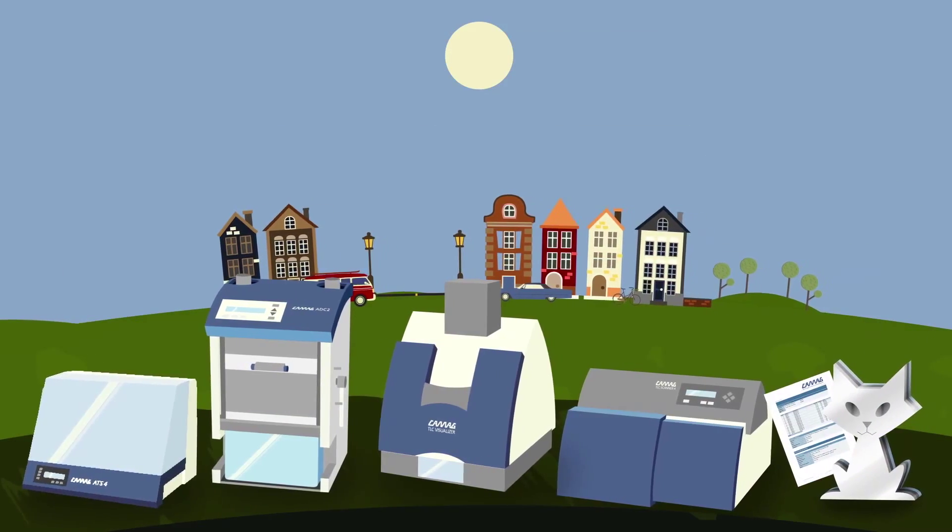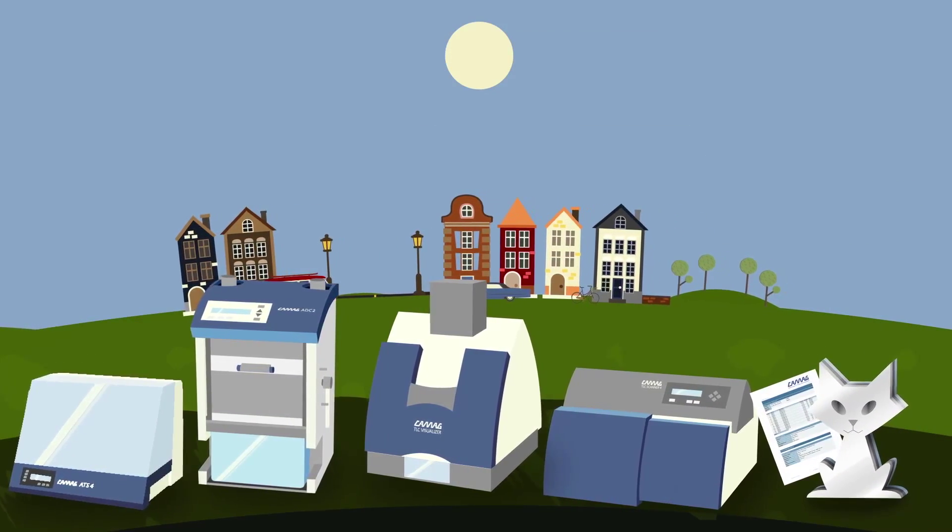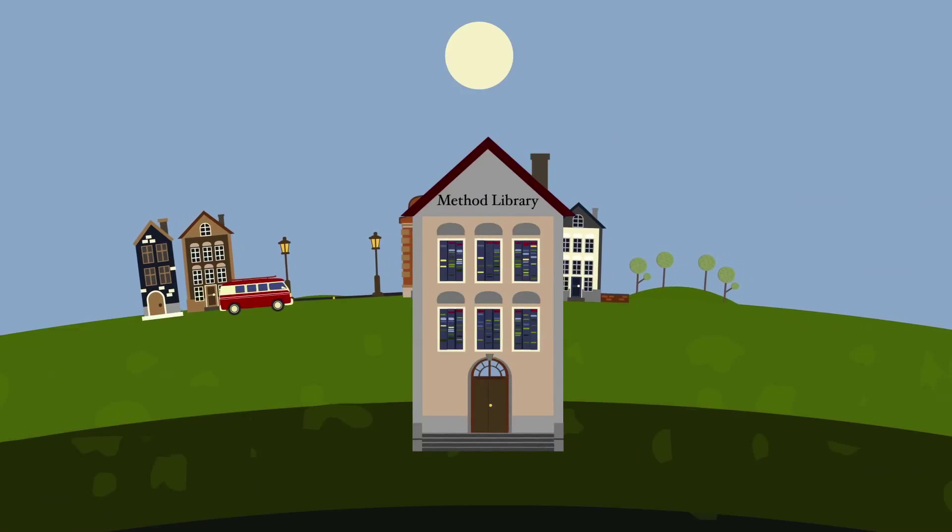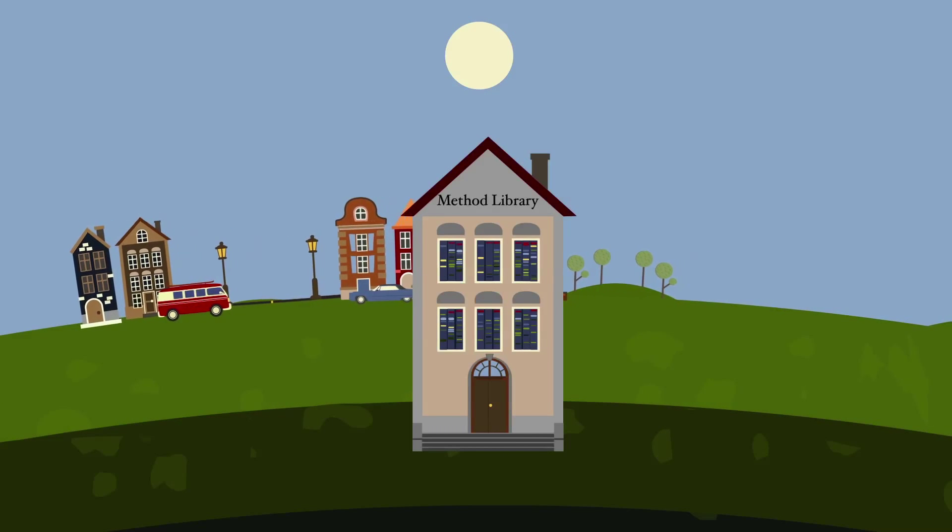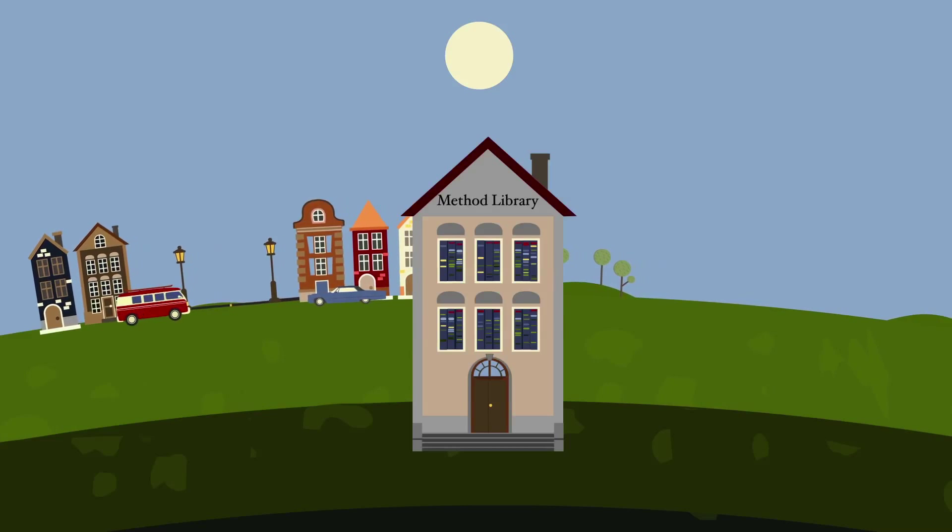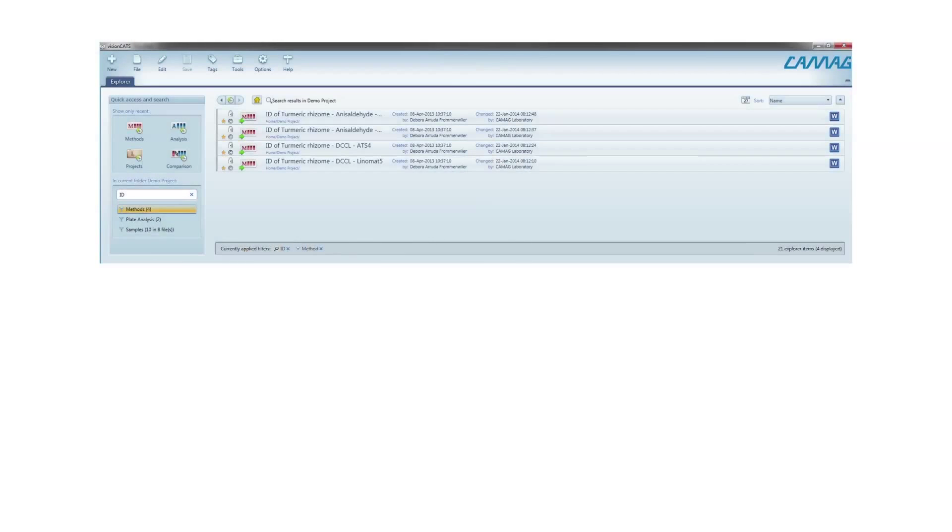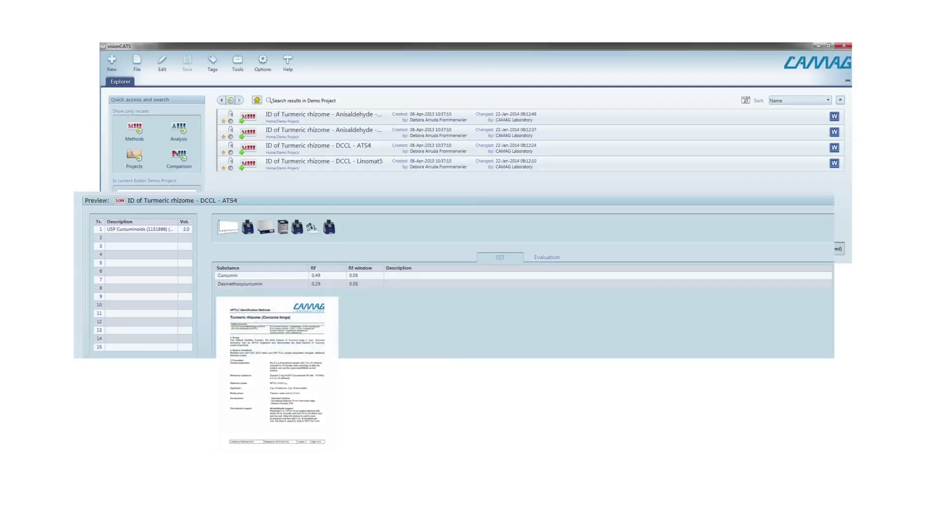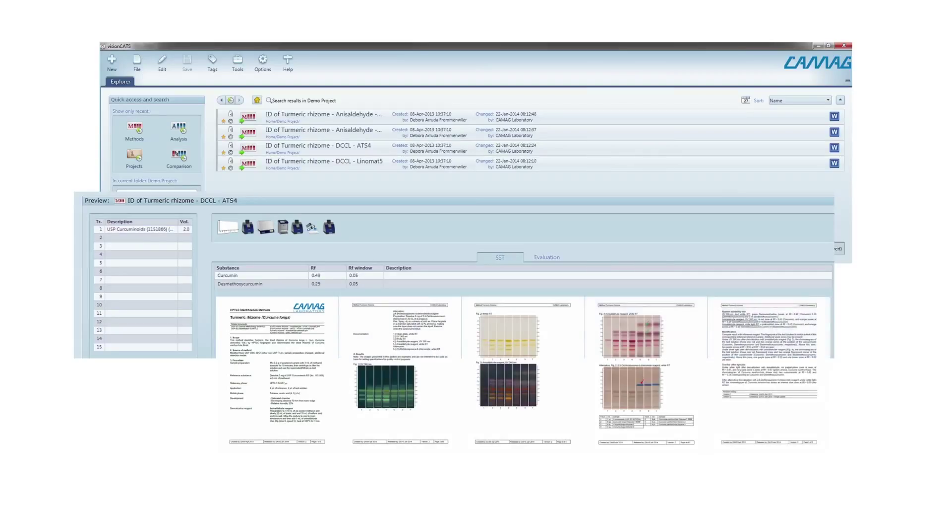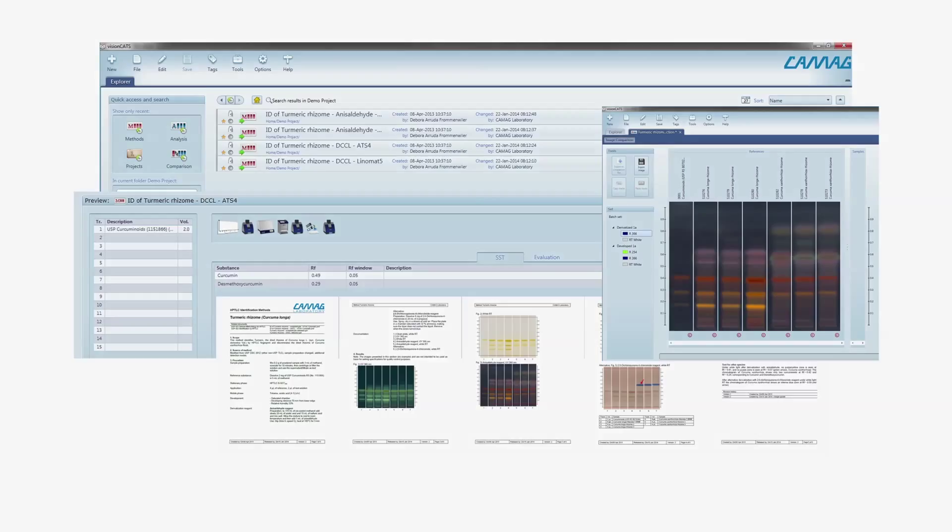As a licensed VisionCats user, you can download validated methods from the HPTLC method library free of charge and import them into your own VisionCats database. Each method includes three files: an instrument method ready to use in VisionCats, a method document that you can use to create your own SOP, and an image comparison file including reference images.